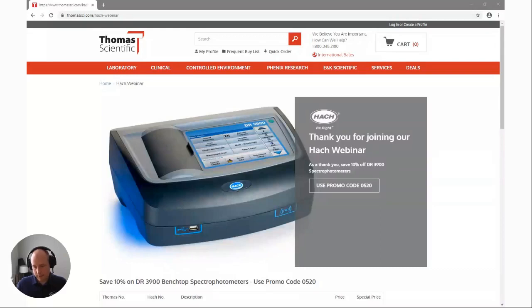The TNT Plus kits are more expensive than the traditional reagent bottles. That being said, based on the number of samples you run, the fact that you have to run blanks, and the costs associated with disposal, there is a payoff period, 2 or 3 years down the line.